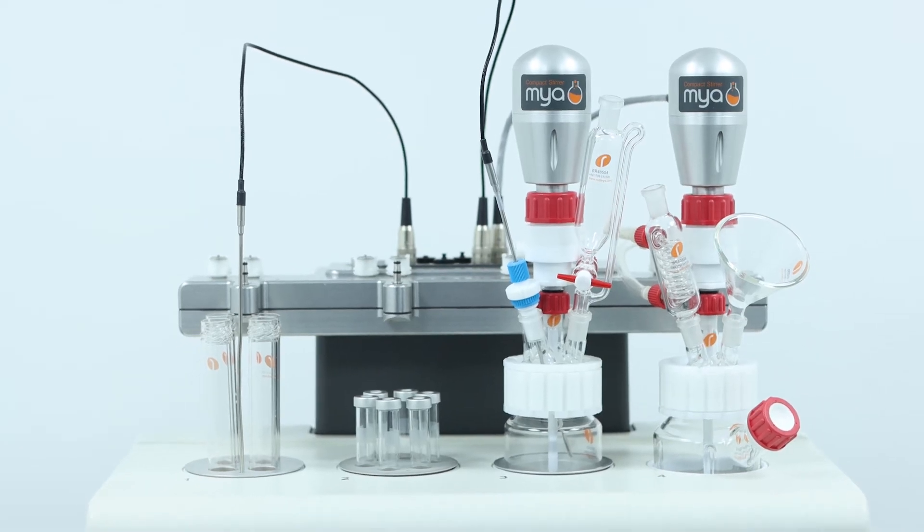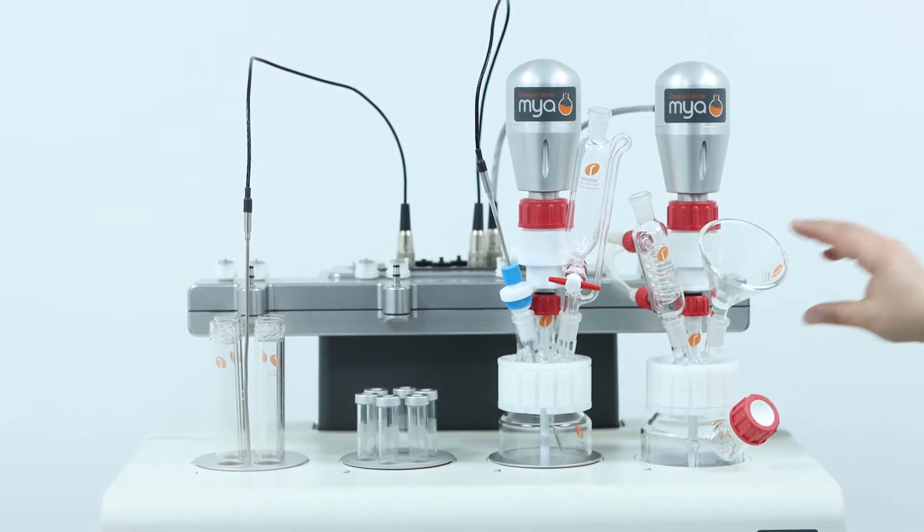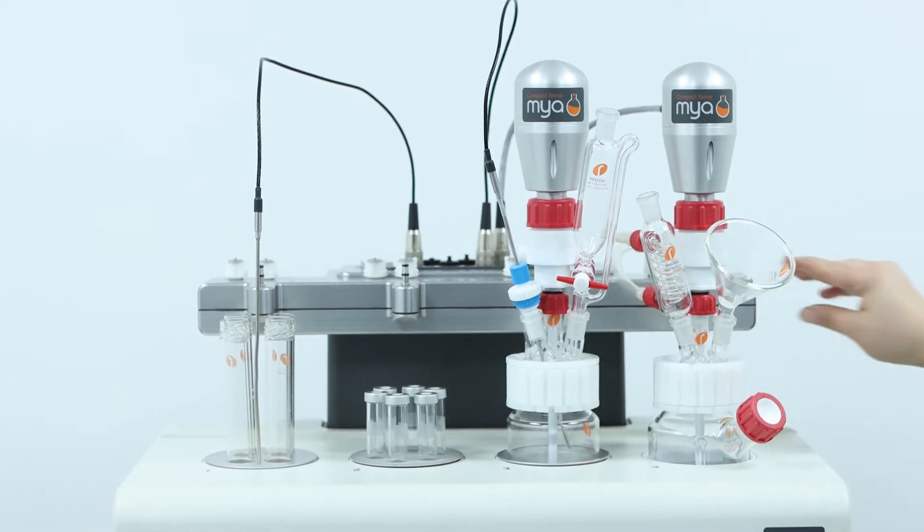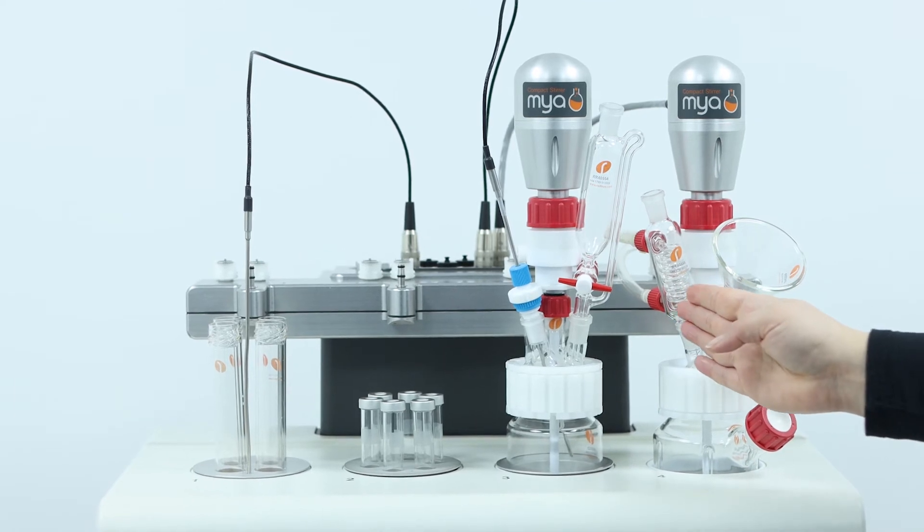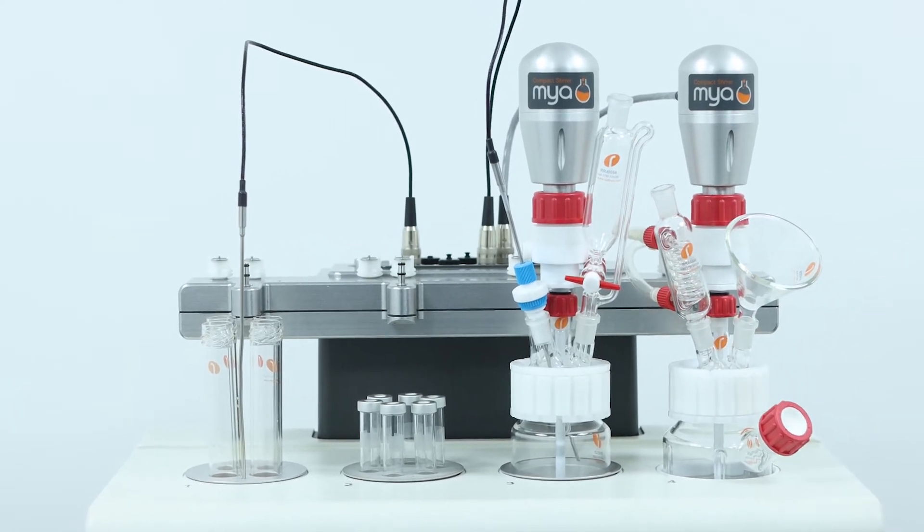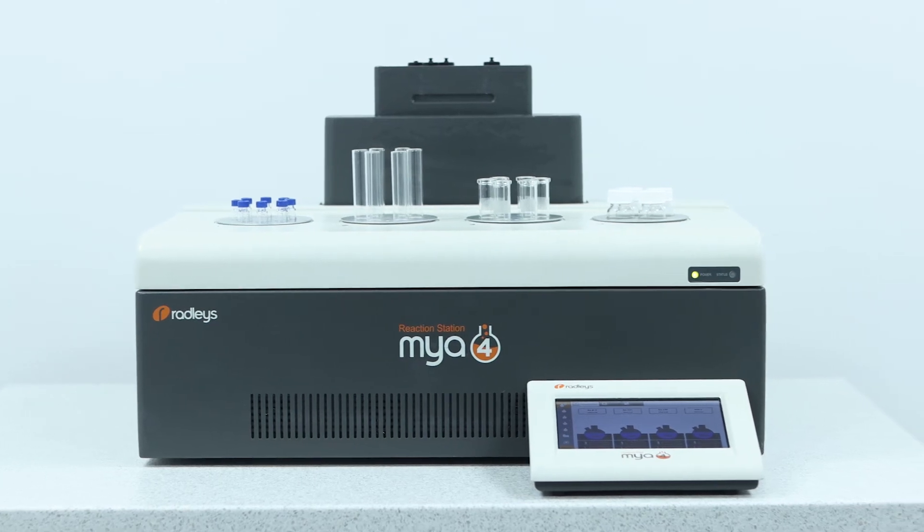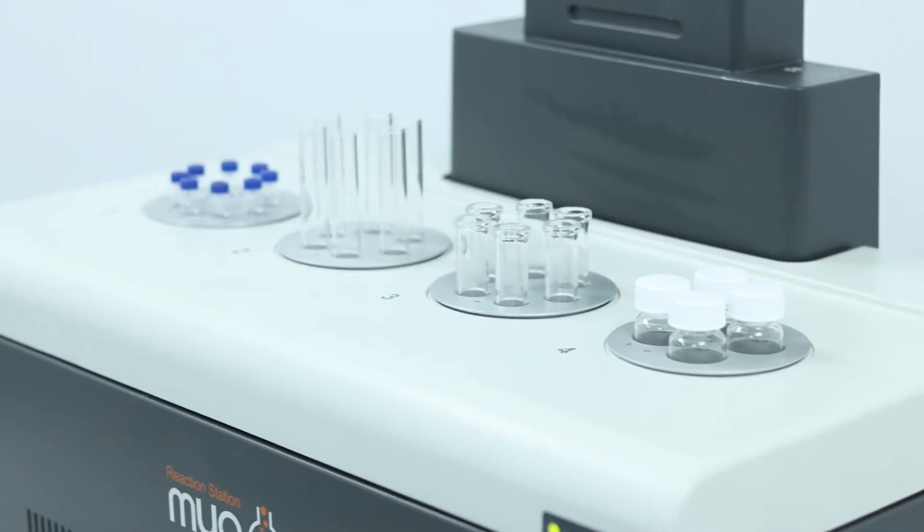As you can see here, the vial inserts are used in the presence of a manifold head. The head is used to provide refluxing and inerting when using vessels and flasks. The refluxing and inerting capabilities don't apply to the multi-position tube inserts.